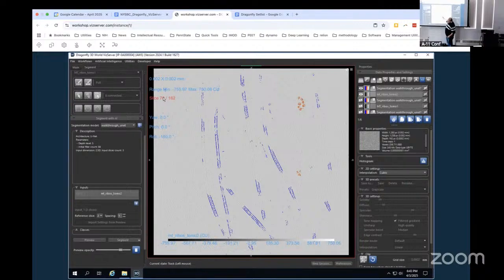So whatever we crop out here has to have all three of those classes in it. There are ways to get around that, but I'm not going to do it today. We can talk about it, but it involves concatenating your data together into one block. Because if one of your chunks of data doesn't have all of the classes in it, Dragonfly and most deep learning will just get annoyed with you, and it won't work. So we concatenate them.